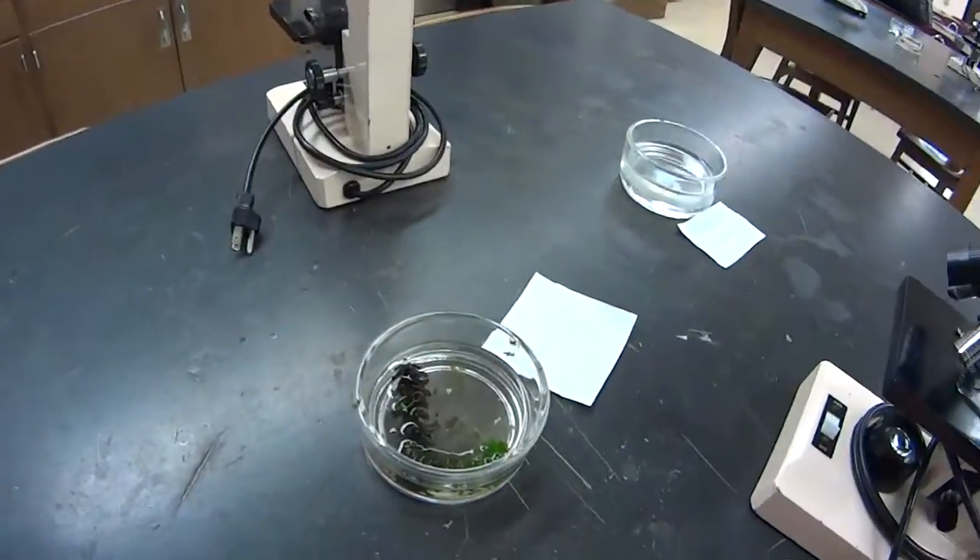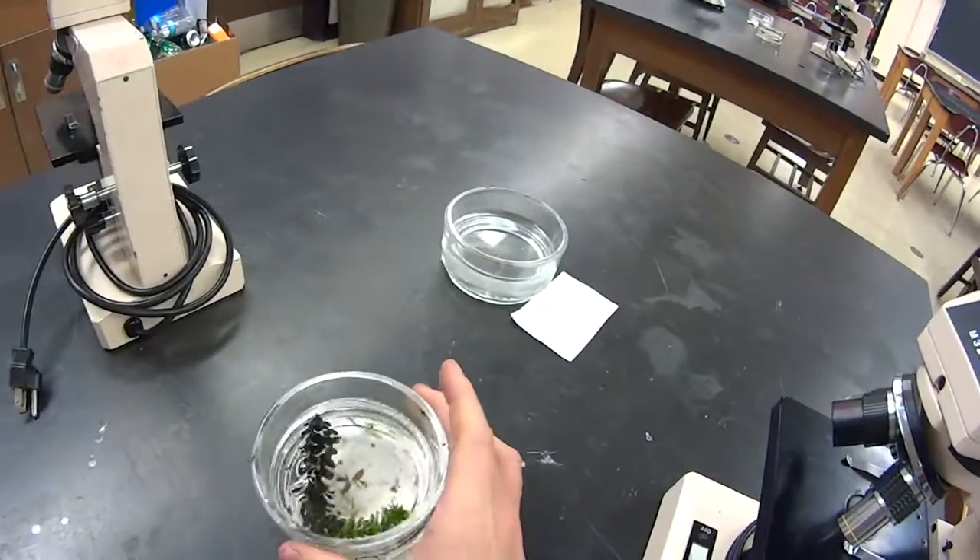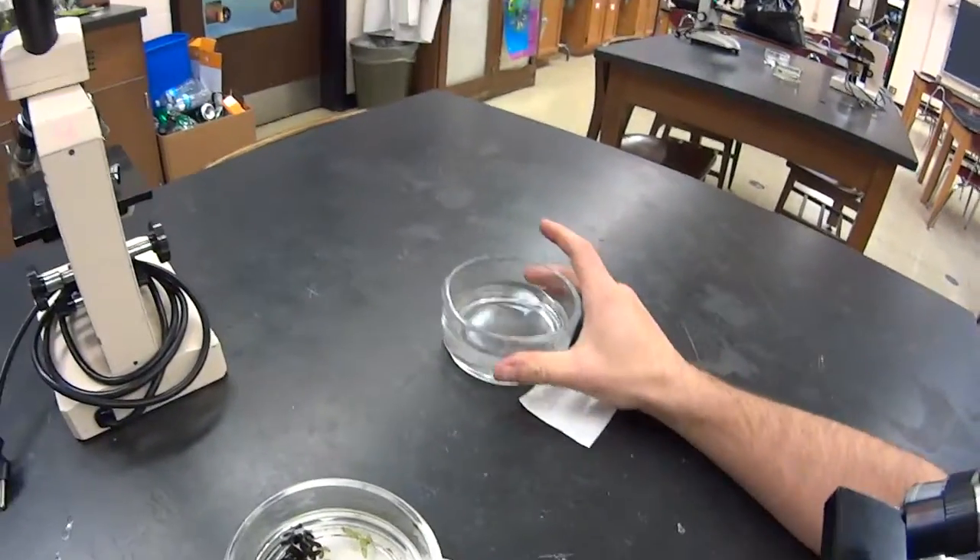You'll notice that over here in the lab you've got pond water, but you also have an area with salt water and they're labeled. The dishes will be sitting on top of them, so you may have to look through it.